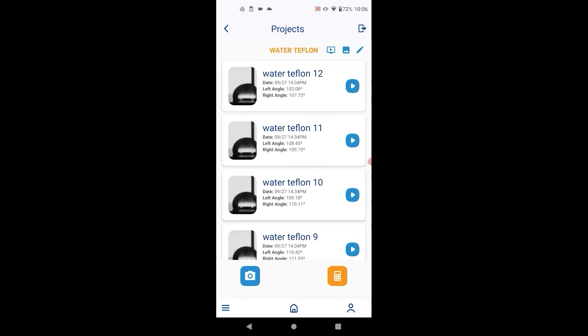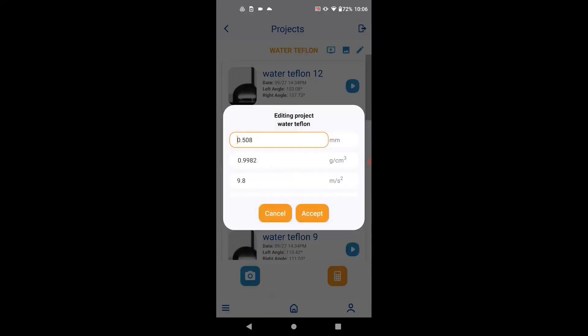A few features that can be accessed from the project screen. The project parameters can be edited.